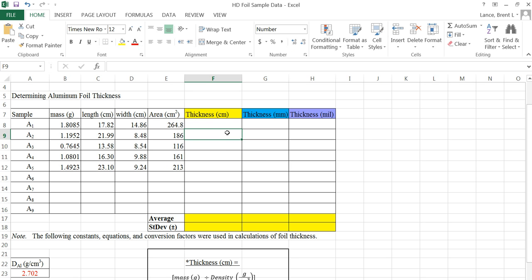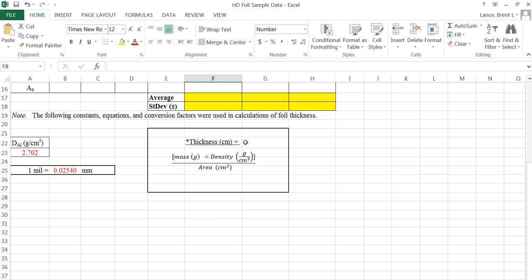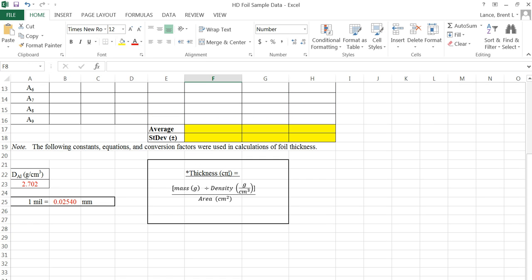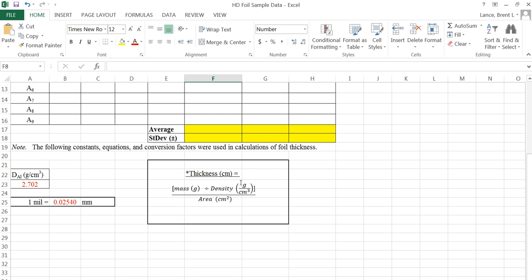The next step is the thickness calculation. The formula we discussed in class: take the mass in grams divided by the density in grams per cubic centimeter, and then divide that quotient by the area in square centimeters — that gives you the remaining dimension of thickness of the aluminum foil. You have to use the density of aluminum, which I gave you. In cell A23, the density of aluminum in grams per cubic centimeter is 2.702, and I put that in its own cell so I can use it in a calculation.